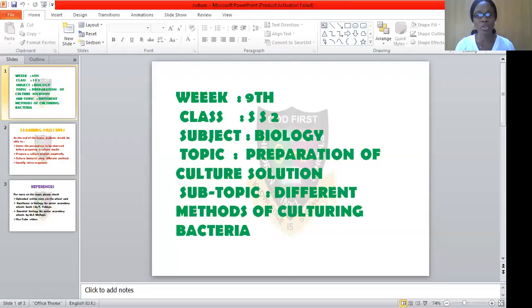Today, we are going to be seeing two videos. One on how to prepare a culture media or solution, and the second one on how to introduce bacteria on our cultured media, that is the culture media we have prepared. Like I said earlier on, our topic for this week is preparation of a culture media and solution under the subtopic of how to use different methods of culturing bacteria on our prepared agar medium.